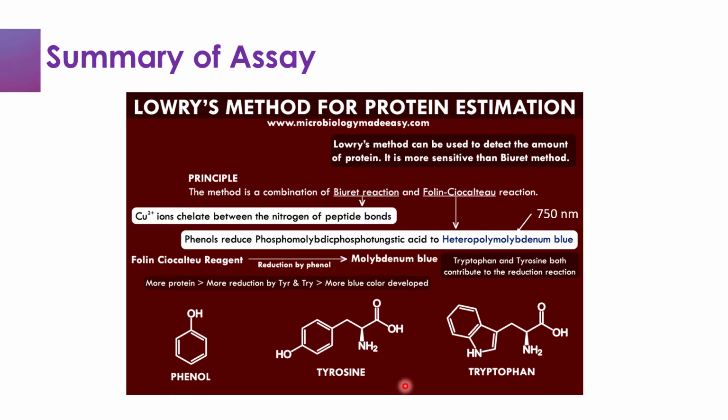So this is just a summary of the Folin-Lowry method in quantifying protein. First of all, we said that the Folin-Lowry method is used to detect the amount of proteins, and it is more sensitive than the Biuret method.